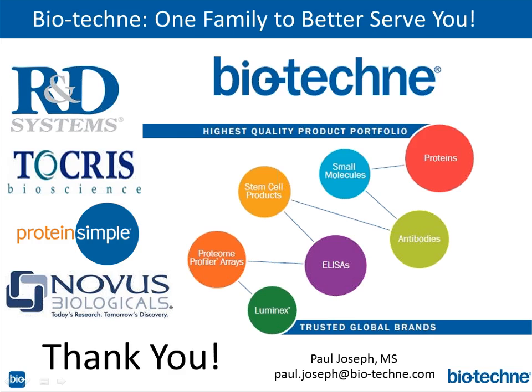I know in-house, in our labs, Jeff Cooper, our lab guy from R&D, was telling me they use hot SDS, like 1%. And that knocks out all the proteases and the phosphatases right there. But I think heat at some point could potentially break down protein. So I think I would just keep it cold.